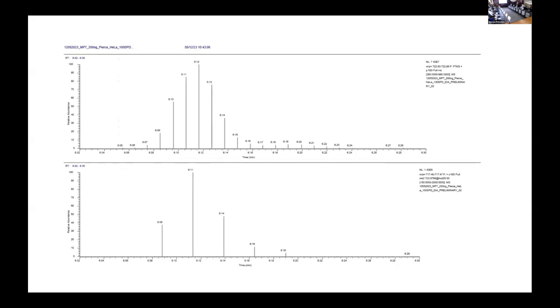Here's another example from that same run, one where the chromatography of a particular peptide isn't perfect. Nobody ever shows these chromatograms, right? Everybody has perfect peptide chromatography, nobody ever has one that looks like this. There's a tail out there. In this one, again, you've got about 3 points defining the quantity of the peak, and then a few more in the tail. I don't care how you do the math, you can't report low CVs when you're quantifying like this. But there are ways to make it better.